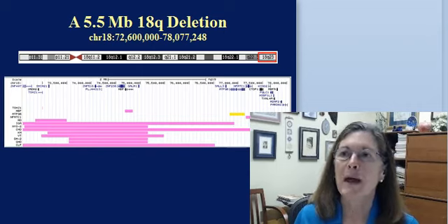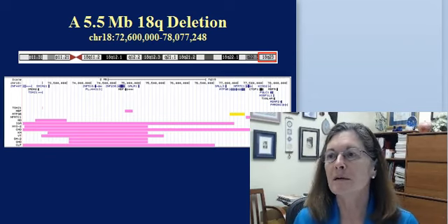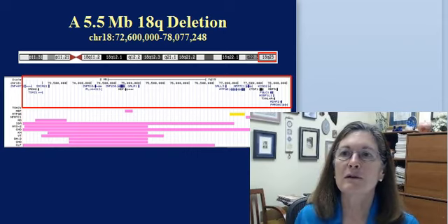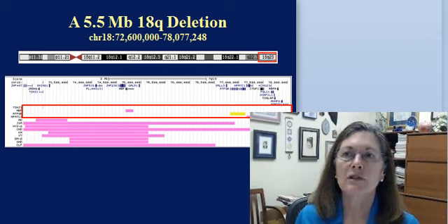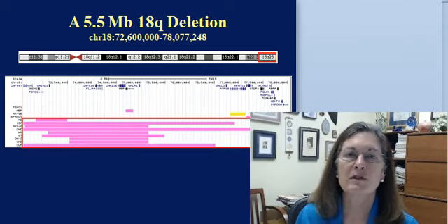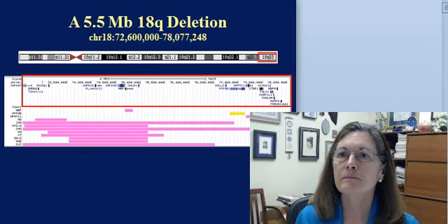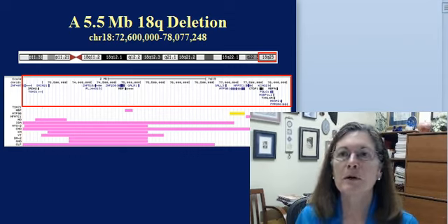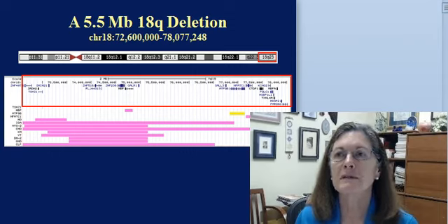So here's the gene dosage map associated with that region of the chromosome, and the gene dosage map shown here has 3 parts. Here are the UC Santa Cruz genome browser genes. Below that are the gene dosage genes from our custom tracks from our gene dosage maps, and below that are the phenotypes associated with that region. You can see there are 19 genes in this region, and the genes are indicated by little vertical hatch marks that are linked by a horizontal line.